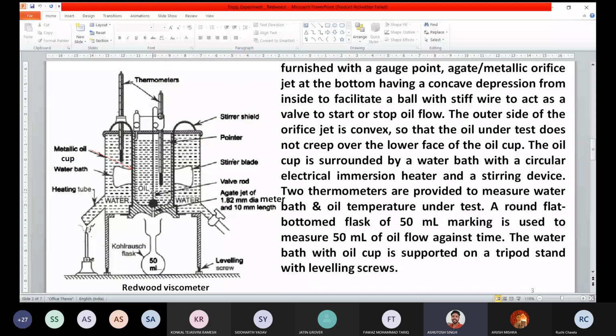Got it? And when you leave it, then again it will cover the hole. And because it is concave in shape, every time you leave it, it will cover the hole. That is why intentionally this has been made concave in nature, so that you leave it in any position, but it will land into the hole.